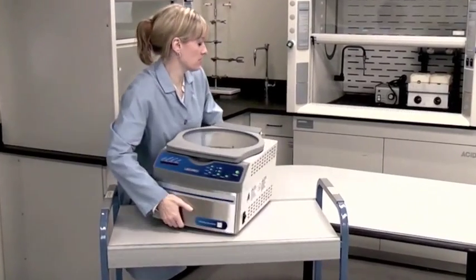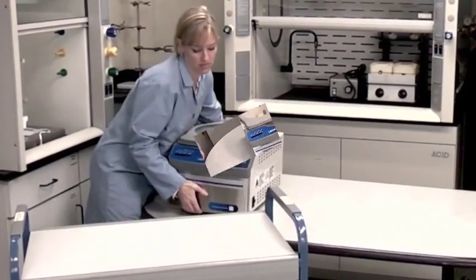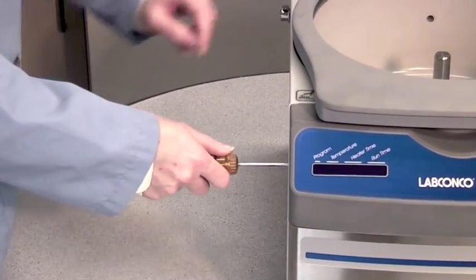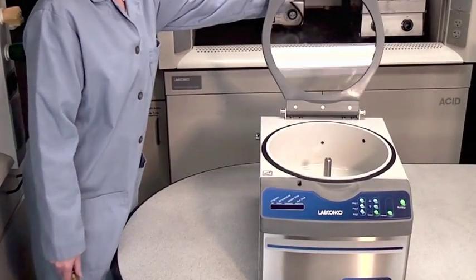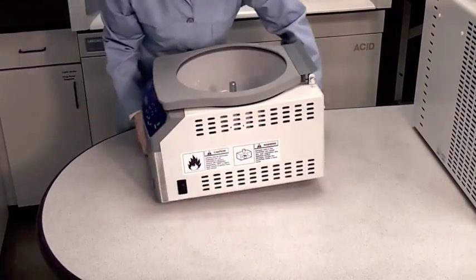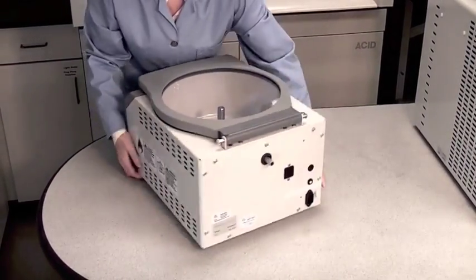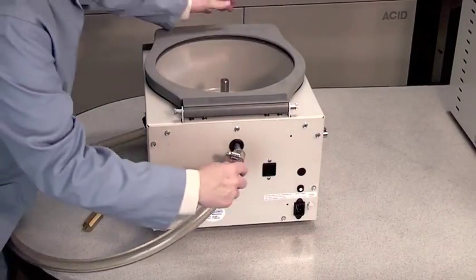Start by placing the Centravap on your lab bench or cart. To manually open the lid while the unit is not plugged in, insert a small screwdriver into the hole on the left side. Attach the vacuum hose to the back of the Centravap and clamp it tight.